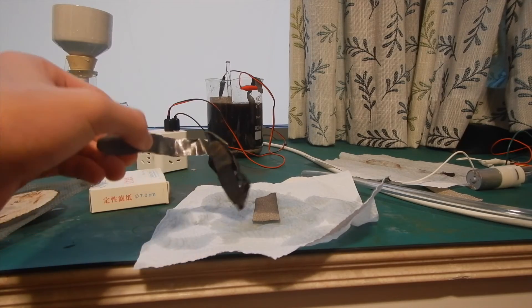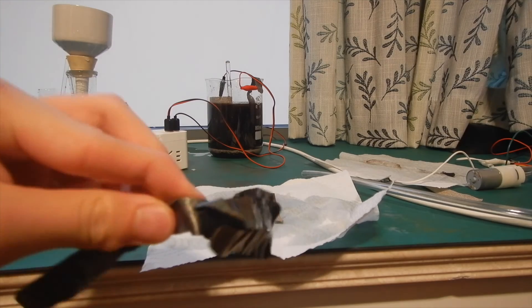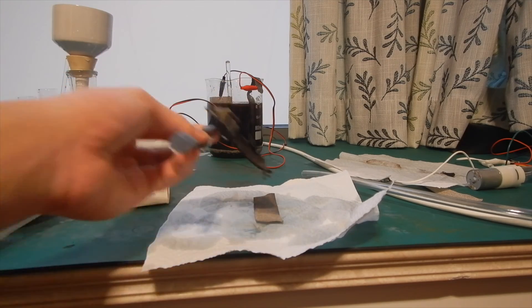Finally, after washing, this is our lead dioxide anode. You can clearly see the brown coating of lead dioxide. Do not copy me by touching the lead with bare hands.